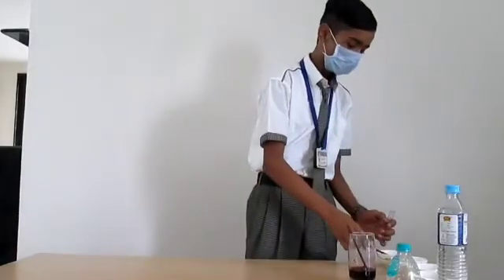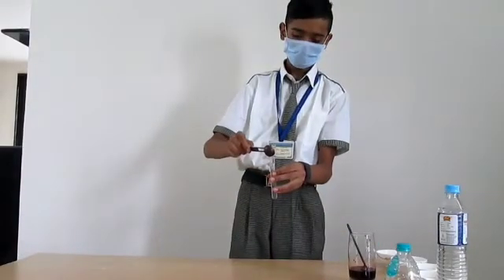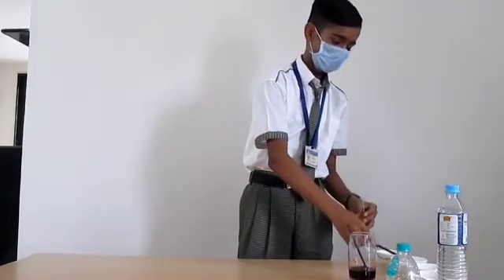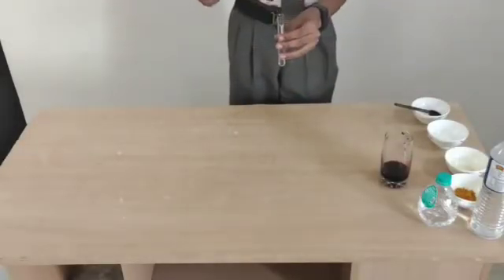Now let's take some pure water in the test kit and add some beetroot juice.